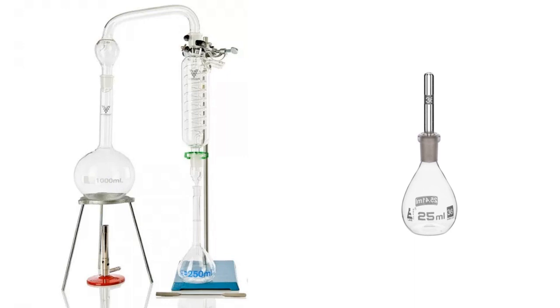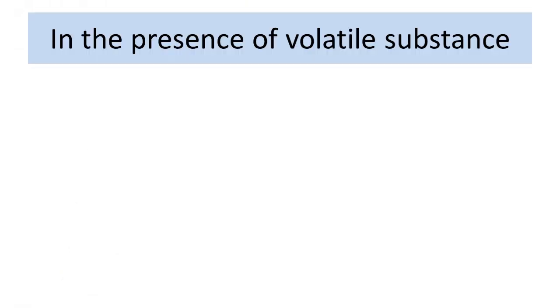This is the specific gravity bottle which is available and this is used to determine the viscosity or density. Weight per ml we can determine. We will be taking the empty specific gravity bottle. The formula for calculation I will show you later and we will be adding the first with water we will measure and then we will add whatever distillate is collected that we will add and then we will measure, we will take the weight of the specific gravity bottle.